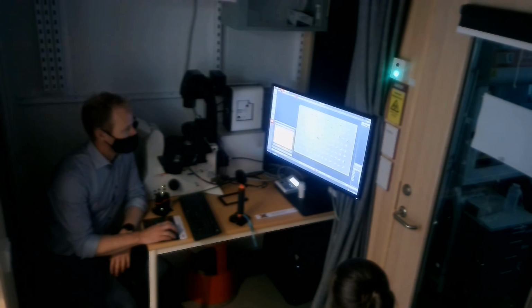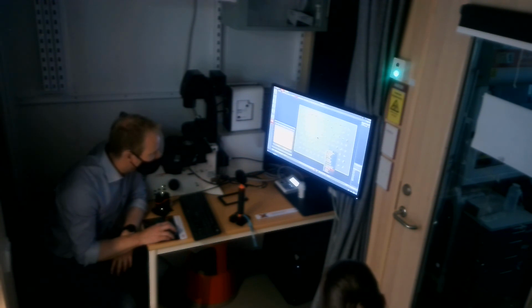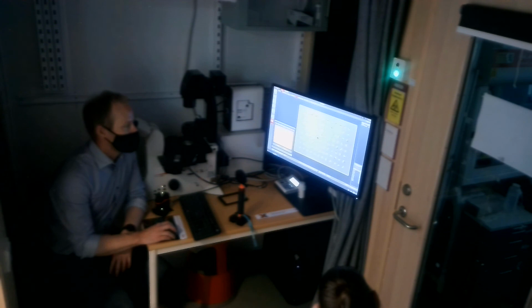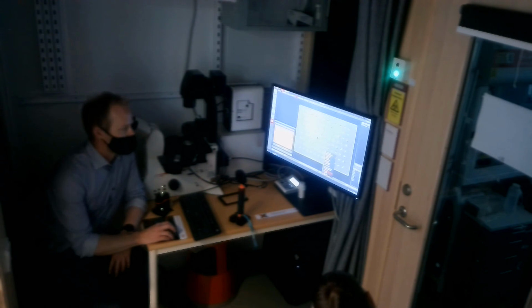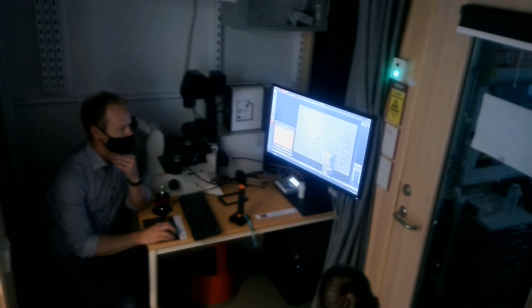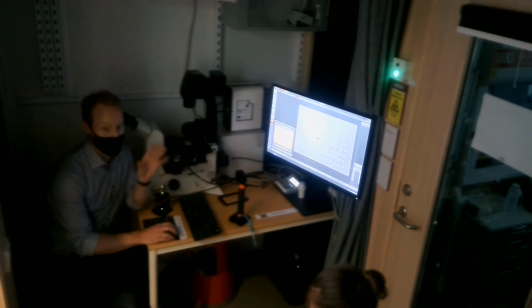You can also, if I again right click here, you can see that you have a few different options here. Yes, right clicking here, you get this save experiment, so that's saving the whole experiment. In some cases you might want to just save the regions. I'm going to use the same sample carrier, but my experiment might be very different.